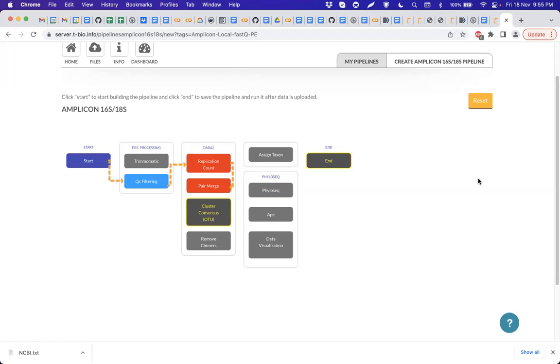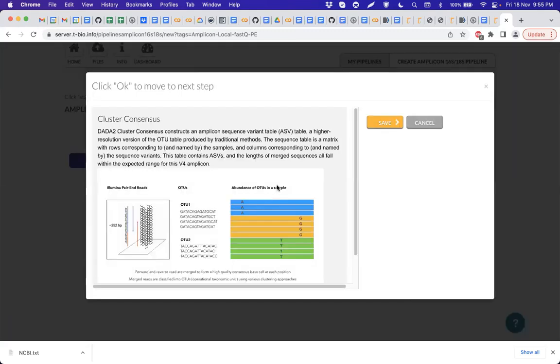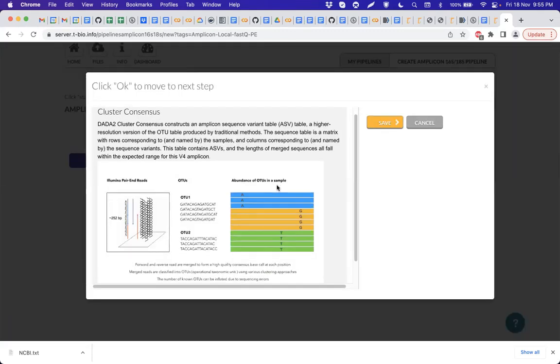And you can move further to cluster these OTUs into those specific OTU clusters, right? And identify as one sequence the one that is going to characterize each of these OTUs. These OTUs have to be defined, no?